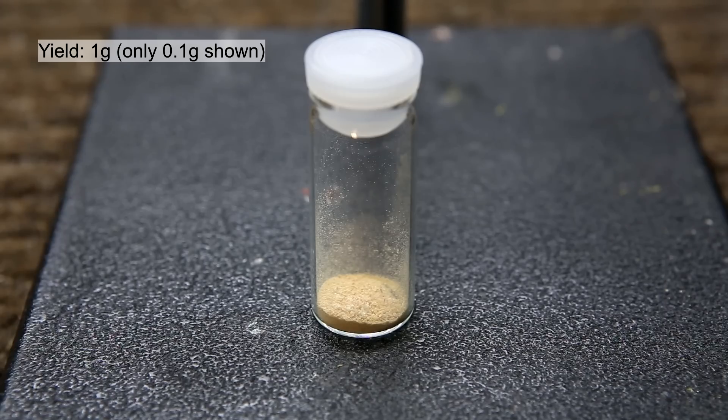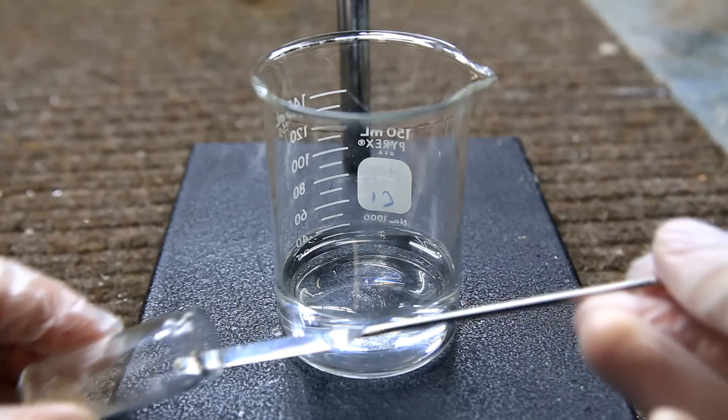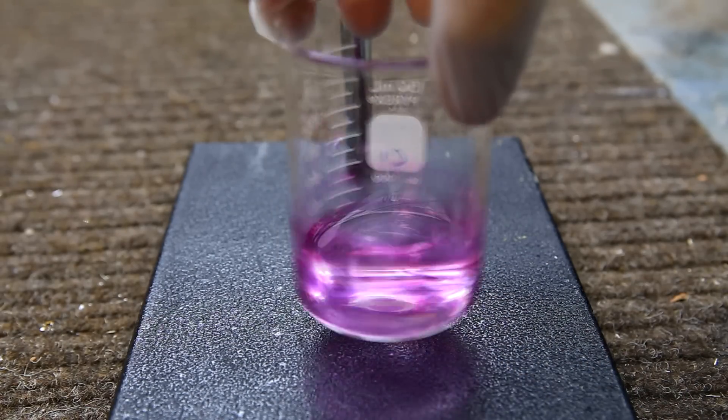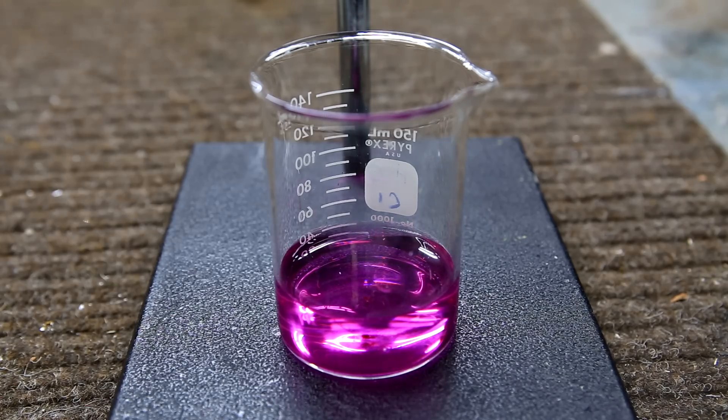Now, to test it, a couple small grains of phenolphthalein was added to a basic solution. And immediately upon the addition, the solution quickly turns purple.